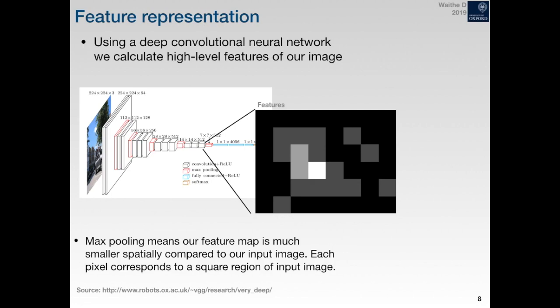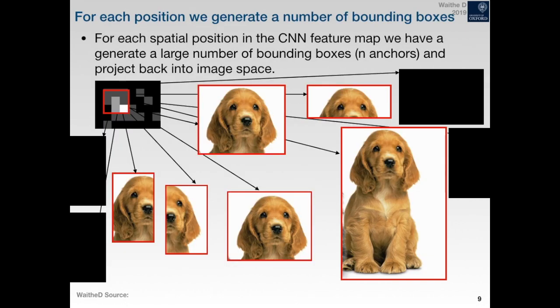You're not going to get how that really works from this lecture, but essentially, from this rich feature representation, it allows you to predict and evaluate bounding boxes around your image, and it will give you a probability and a class of that being an object.